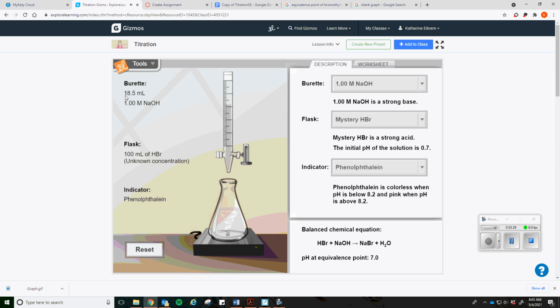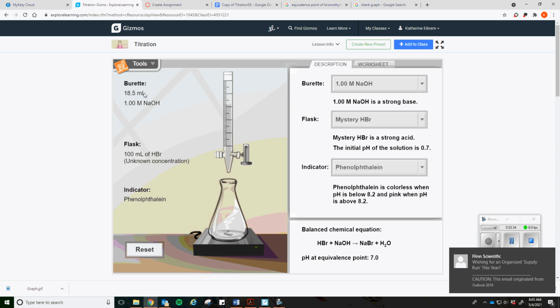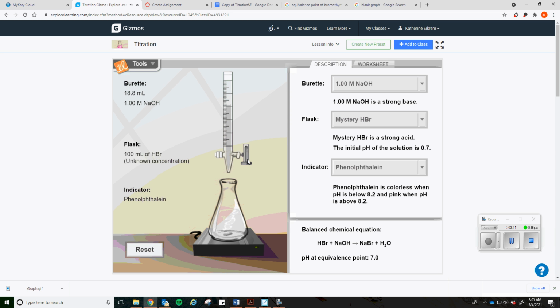And as you can see, as I'm putting my titrant into my analyte and titrating it, my volume is going up. So it's keeping track of that for me as I go. If you go too far, oh, and I went too far, way too far. If you go too far, turn it off and always click reset. And it'll reset your factory settings so that you can start over again. Remember, if you do go too far, you do have to do it again so that you can make sure that your calculations for your titration are correct.